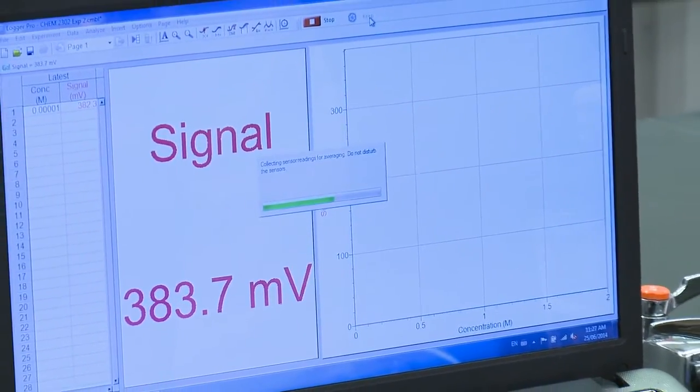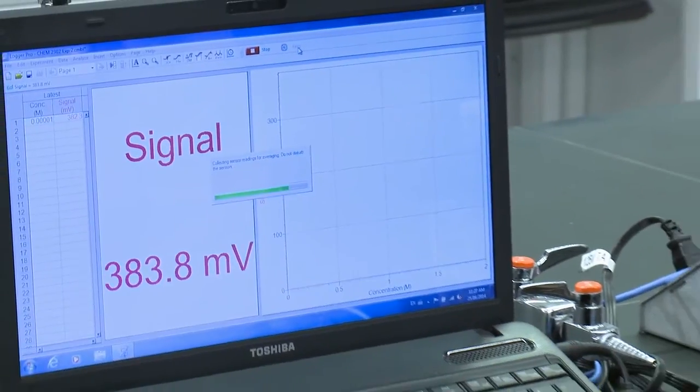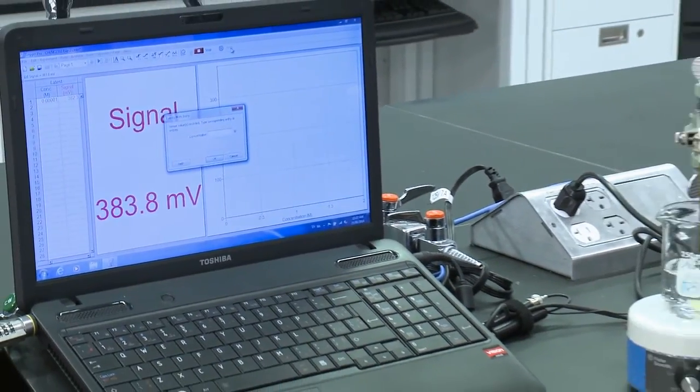Once that's completed, you need to exchange the solution with your next measurement. Wait an additional three minutes and repeat the process.